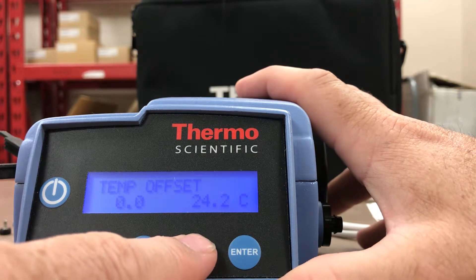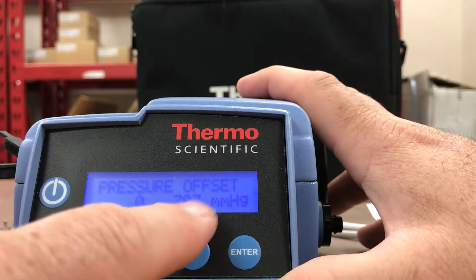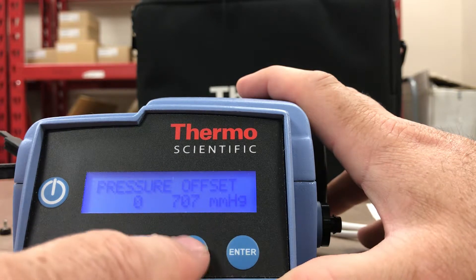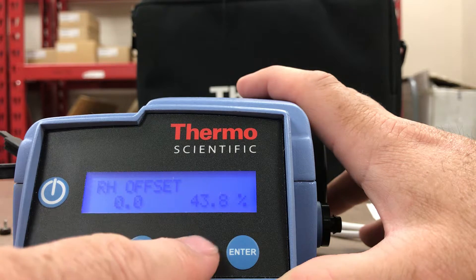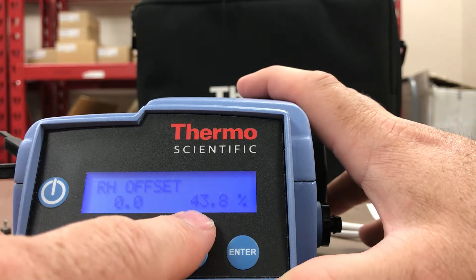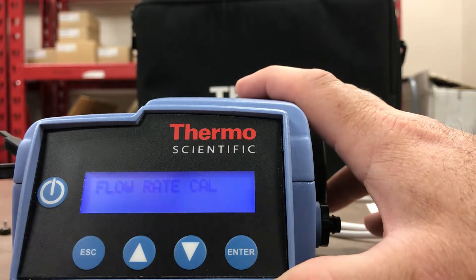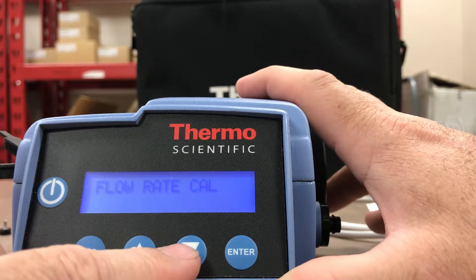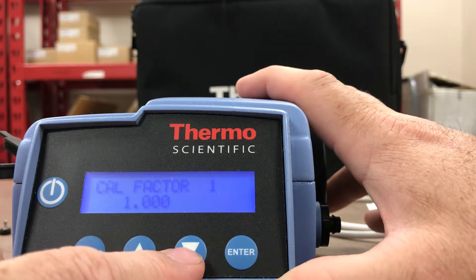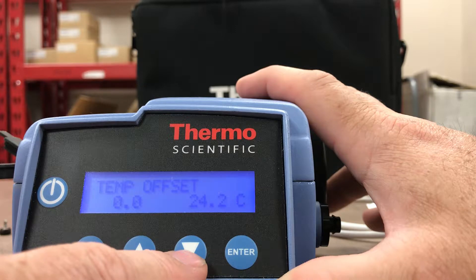Looking at Calibrate: there's a temperature offset, pressure offset — you can have a millimeters of mercury pressure offset — and relative humidity offset. Right here it's reading 43 percent. There's also a flow rate calibration you can do if you have a flow meter, and a calibration factor of one.